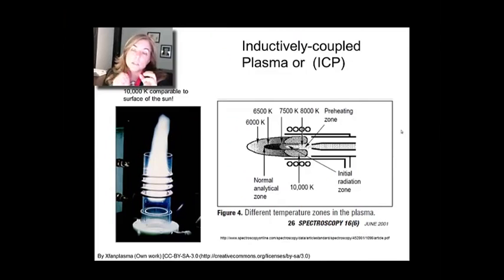And when the system sparks, it just happens once, or you sometimes do it a lot of times. It's kind of like starting a lawnmower. But once you spark it, you get some ions forming. And in an electromagnetic field, ions do something totally different. They start moving around. So this RF frequency, radio frequency field, is sloshing back and forth, and neutral argon doesn't do a thing. Charged argon starts to slosh around too, as it moves with the field, and it slams into other argon atoms over and over, and those lose electrons and then they come back down.